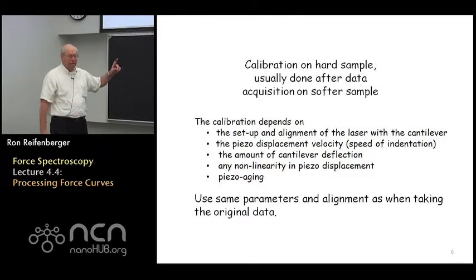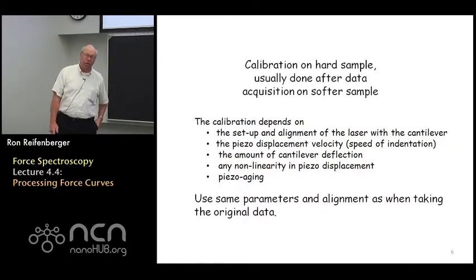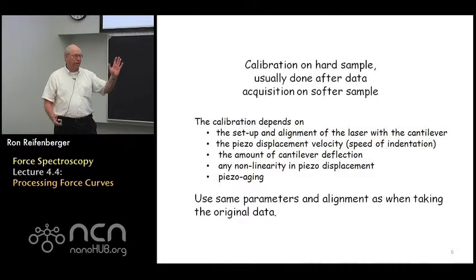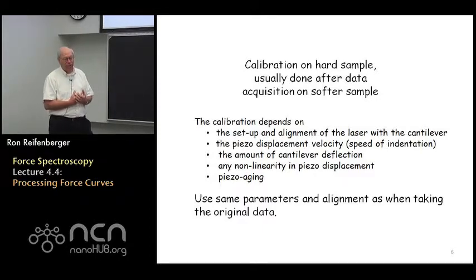I'd just like to say that the calibration on a hard sample usually is done after the indentation on a softer sample. It's important for you to do that calibration because that defines the limiting case where there's no indentation. That limiting case changes from day to day, right? It depends on how the laser beam is adjusted onto the cantilever.